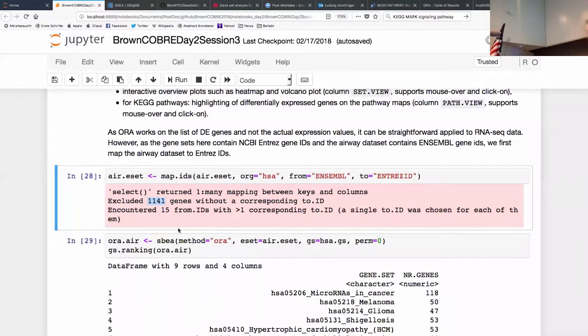There is unfortunately no trivial, easy solution to that. The solution would be you sit down for hours, maybe days, weeks, and go one gene by one through it and do the mapping by hand. Typically, you don't want to do that and say, okay, you lose something, but you still have thousands of genes you're analyzing, and there is a lot of signal in these.